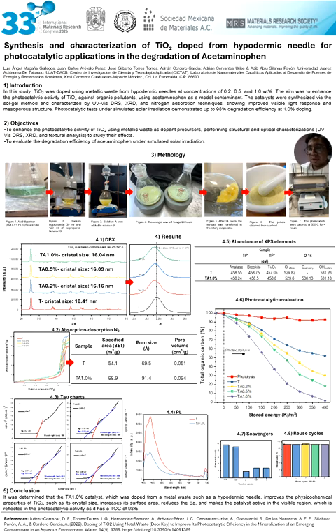And after doping, all the parameters increase. For example, Ta1% has a pore size of 91.45 angstroms and pore volume of 0.0945 cubic centimeters per gram, and obtained more than non-doped titanium dioxide.